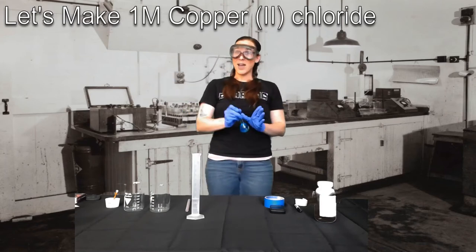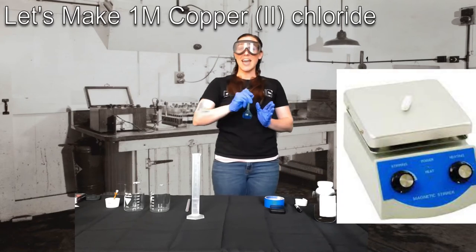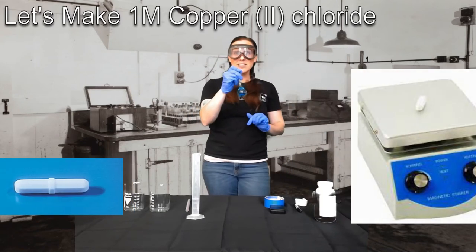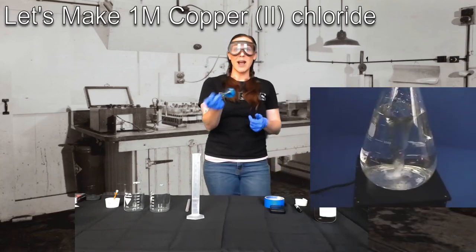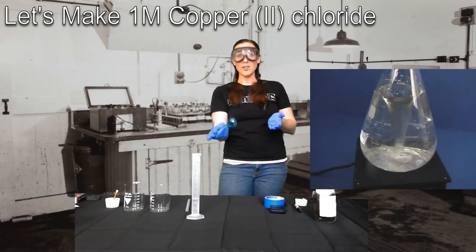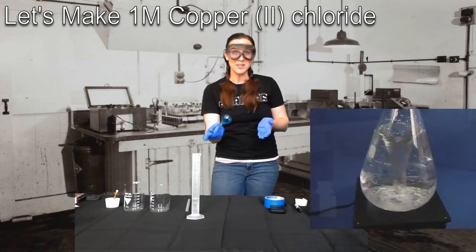Or, even better yet, if you have a magnetic stir plate and you have a little magnetic stir rod, you can plop one of those in there and have the magnetic stir spin it around for you. That, of course, would be the best option to make sure that all of your solute is evenly distributed throughout your solvent.